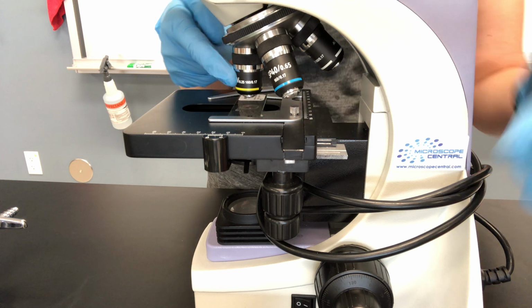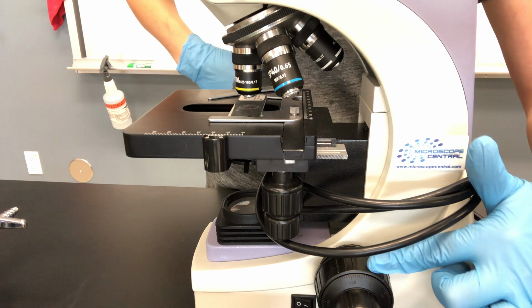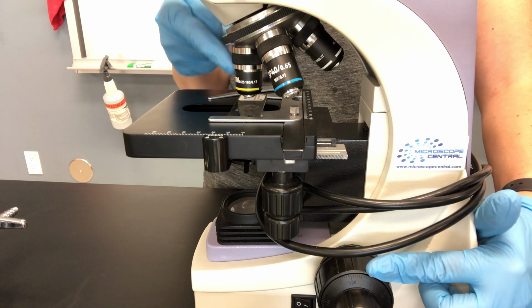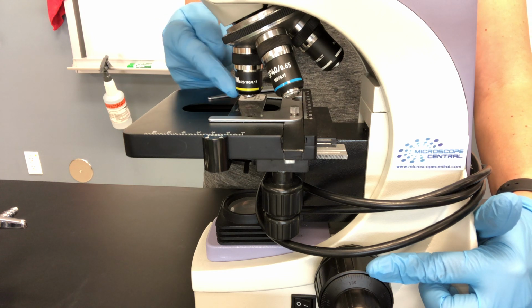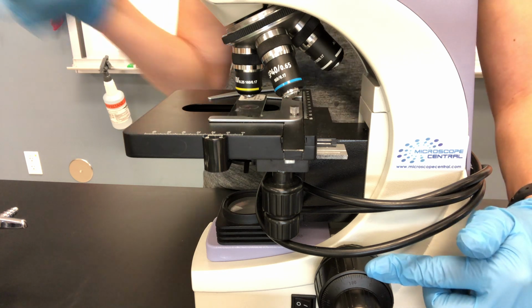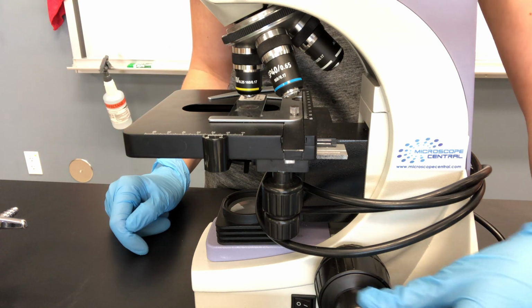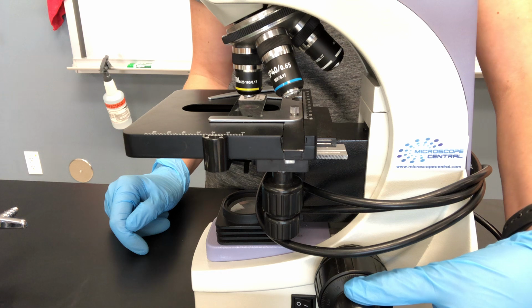Once you do this, we no longer touch this coarse focus knob because it moves the stage too much, and if you'll notice, our objectives are quite a bit longer, and we do not want to break the slide or scratch the objective lens. So looking through the eyepieces, you'll then just use the fine focus to get things just how you want them, so it's nice and clear on that low power.